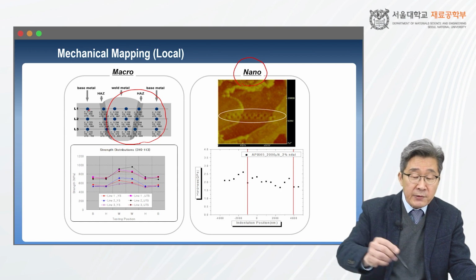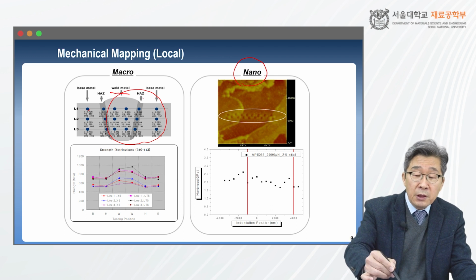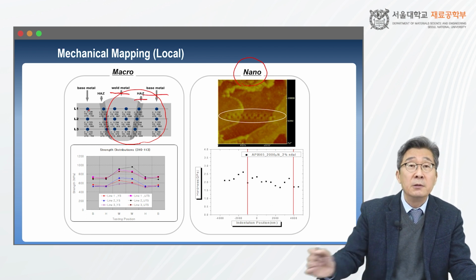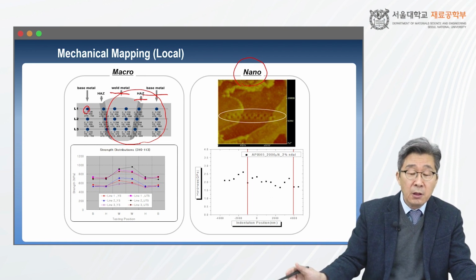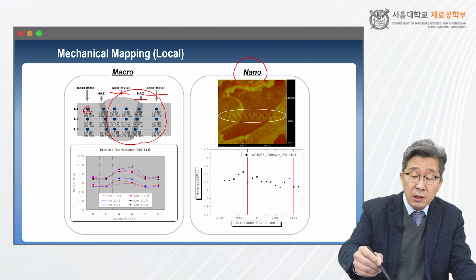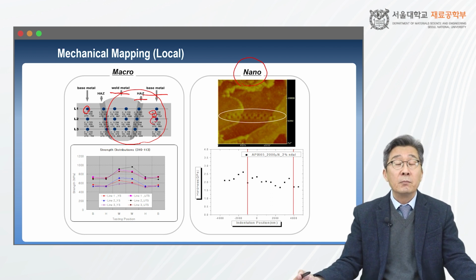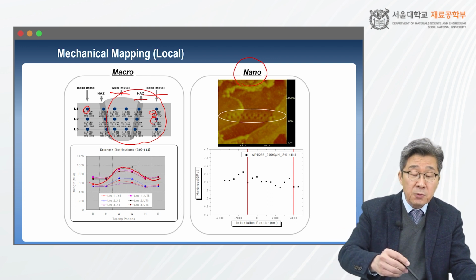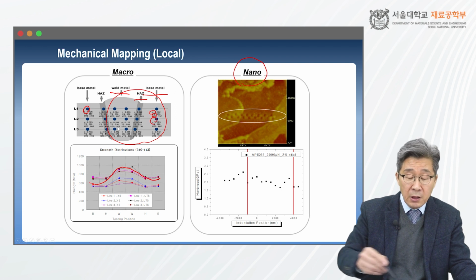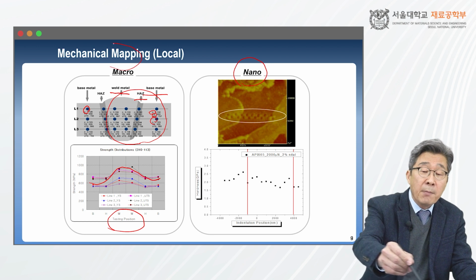For instance, when assessing the mechanical properties of weld metal, heat affected zone, and base metal, at each indentation site we can get multiple data in terms of strain hardening exponent, yield strength, and ultimate strength, which means we can map mechanical properties in terms of different mechanical behavior as a function of testing position. We call it mechanical mapping.